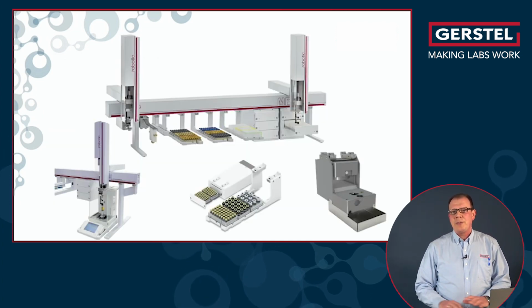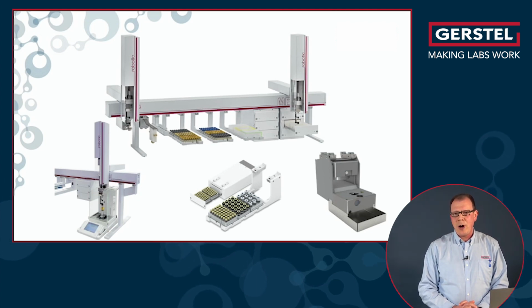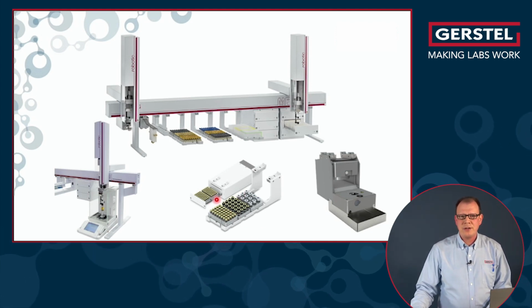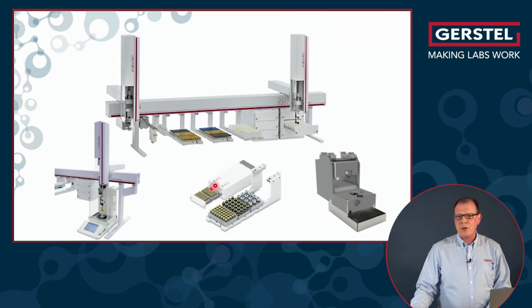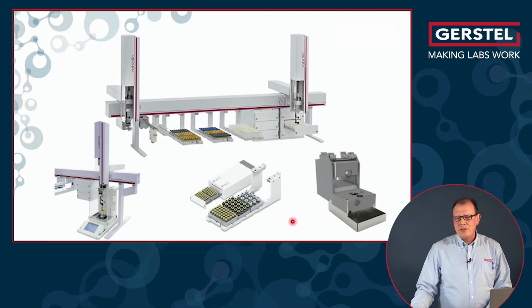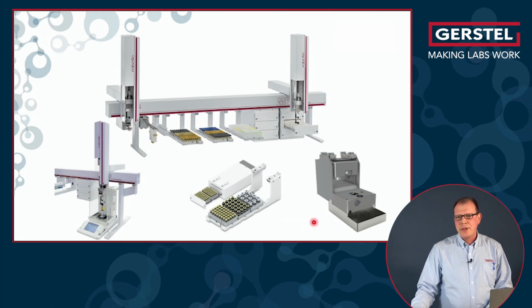Okay, of course, besides this liquid handling, we need more hardware. For example, we need a couple of trays for storing different vials, 2, 4, 10, 20 milliliter. And these vials could also be stored cooled. That's as well possible. Sometimes it's very useful not to pierce a vial septum.